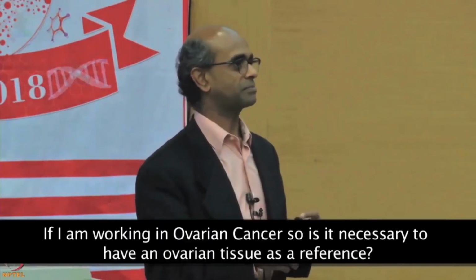But if you want to know whether a protein was high in sample 1 versus sample 2, you can, because we are measuring relative ratios to the reference. So the advantage here is that it minimizes the manipulation of data you need to do later, and takes care of batch effects and other systematic technical artifacts in a more agreeable way. But the downside is that you can't make absolute level comparisons.